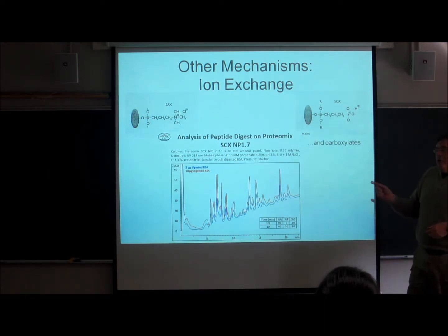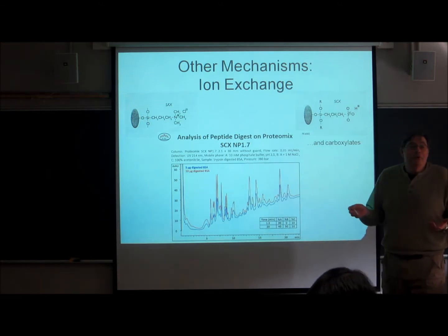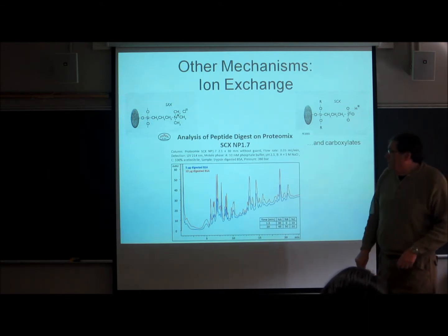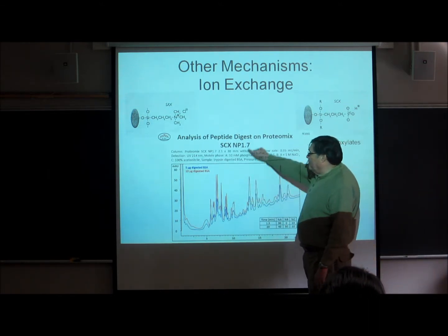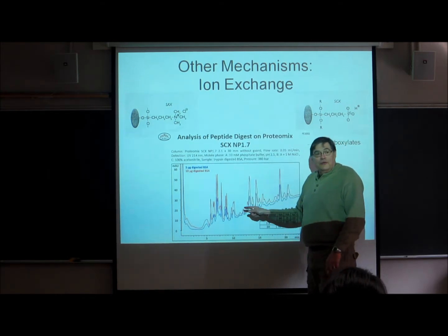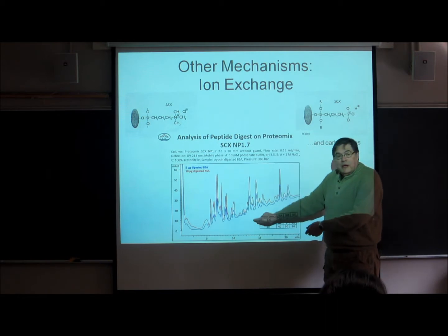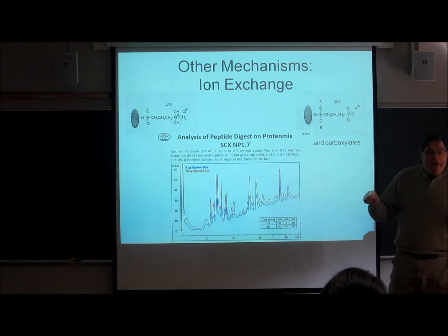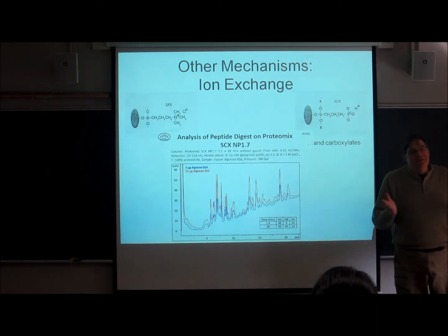Let's say, since it's bovine serum, just fancifully, we have a mutant cow. We want to see if we can figure out what's wrong with the cow. So we take the serum albumin, and let's say we find a peak out here that's double the size. If we can track this down and identify where that peptide lies in the chain with the help of our friends in biochemistry, then we have a way to understand more about that mutant cow. All right, I'm sorry, but you get the idea.